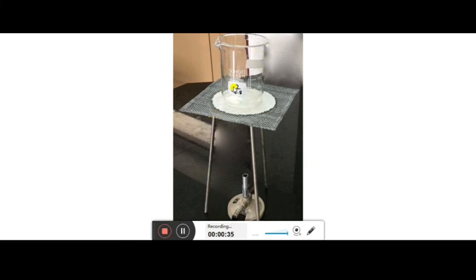If you have to do the evaporation process, you can fill the beaker with the help of the graduated cylinder. You can fill 100 ml of water in this, though the capacity of this beaker is 250 ml. Now you can mix some salt in this, and then do the boiling process by burning the Bunsen burner. When it starts burning, the wire gauze will distribute the heat uniformly, and then you can do the experiment very easily. So this is the arrangement done for the simple experiment.